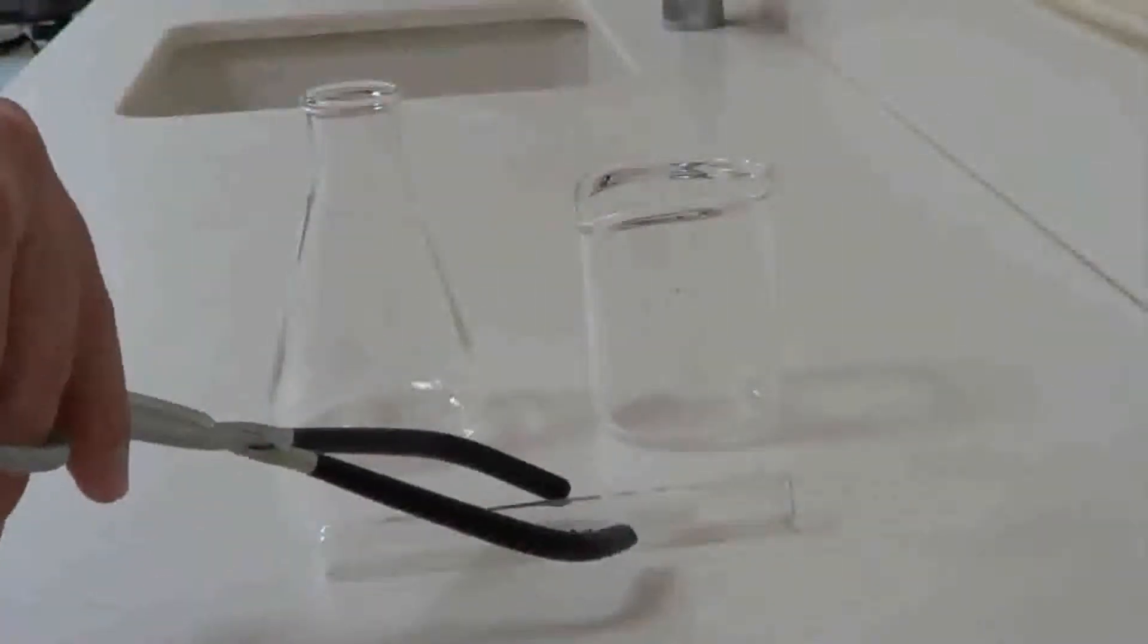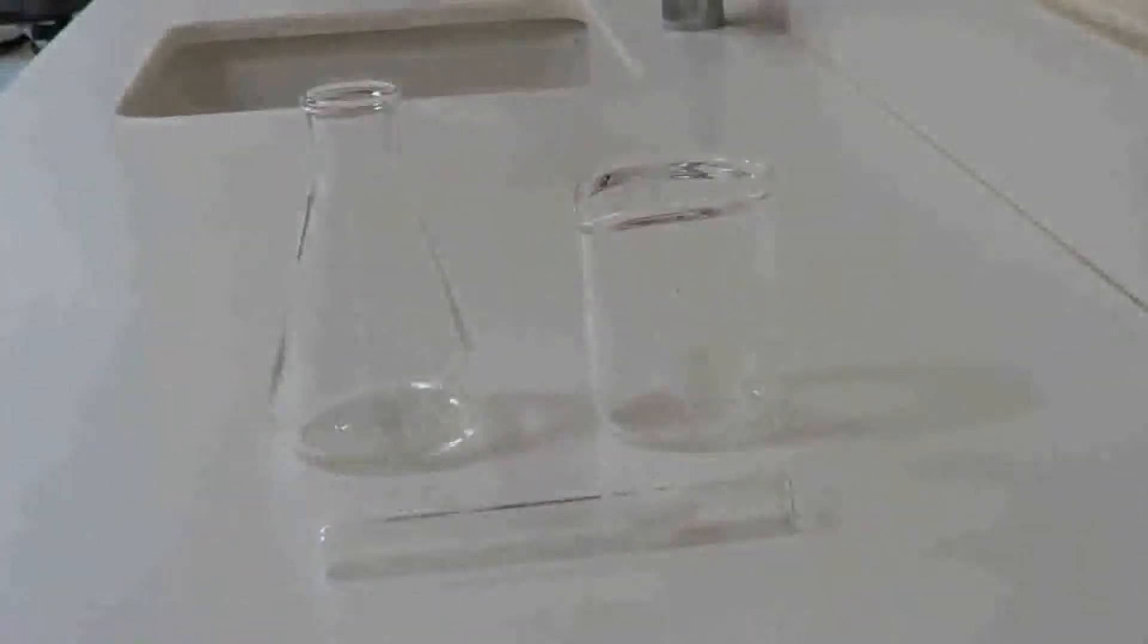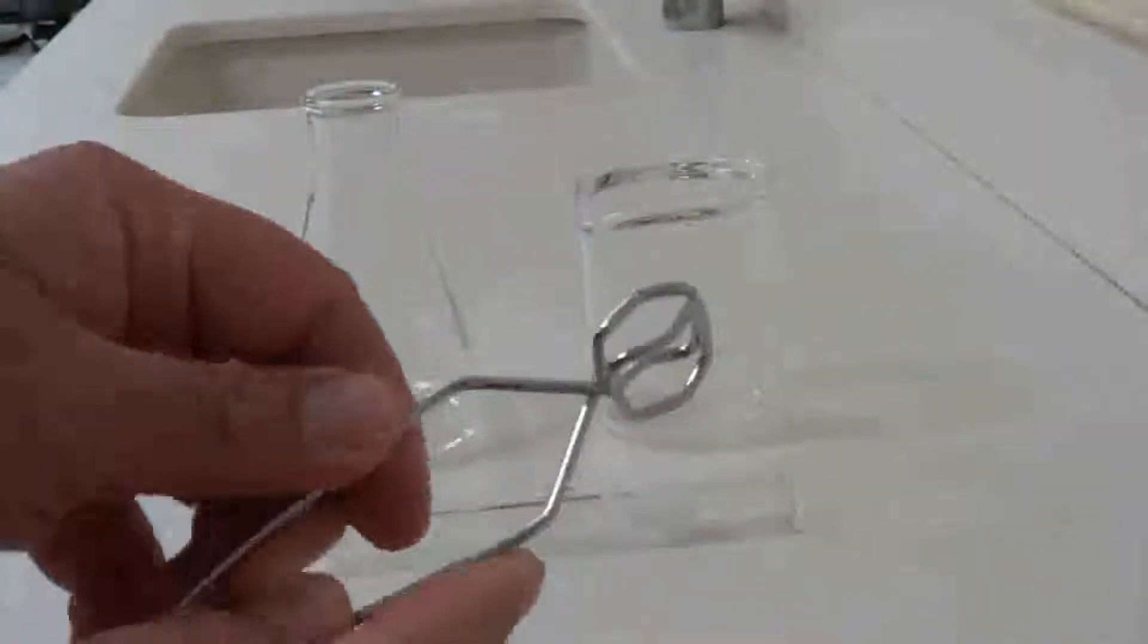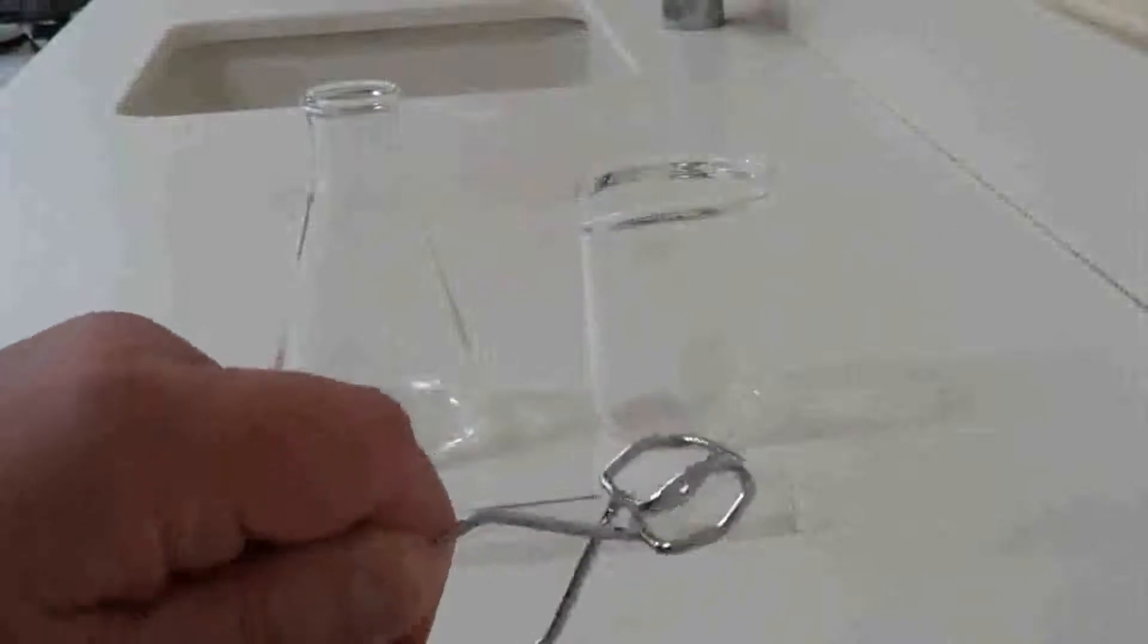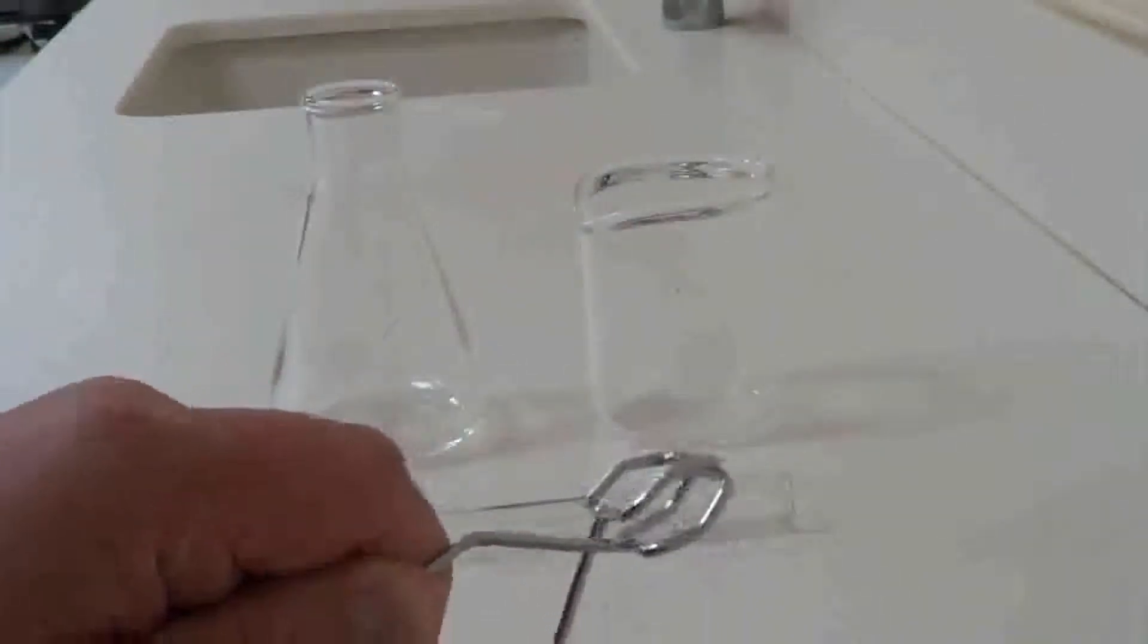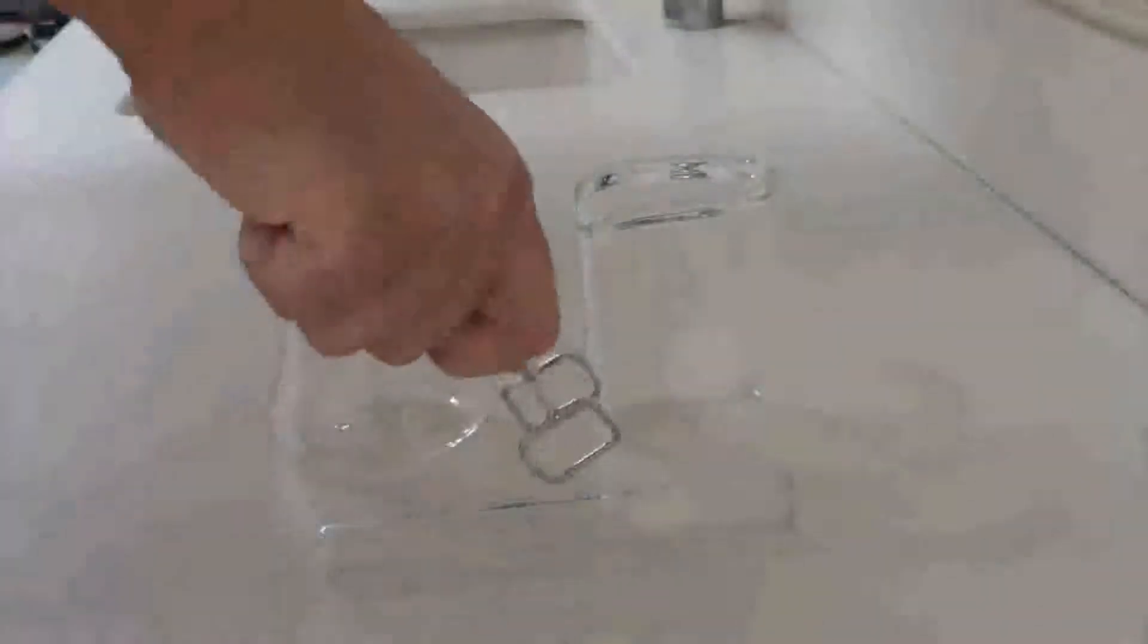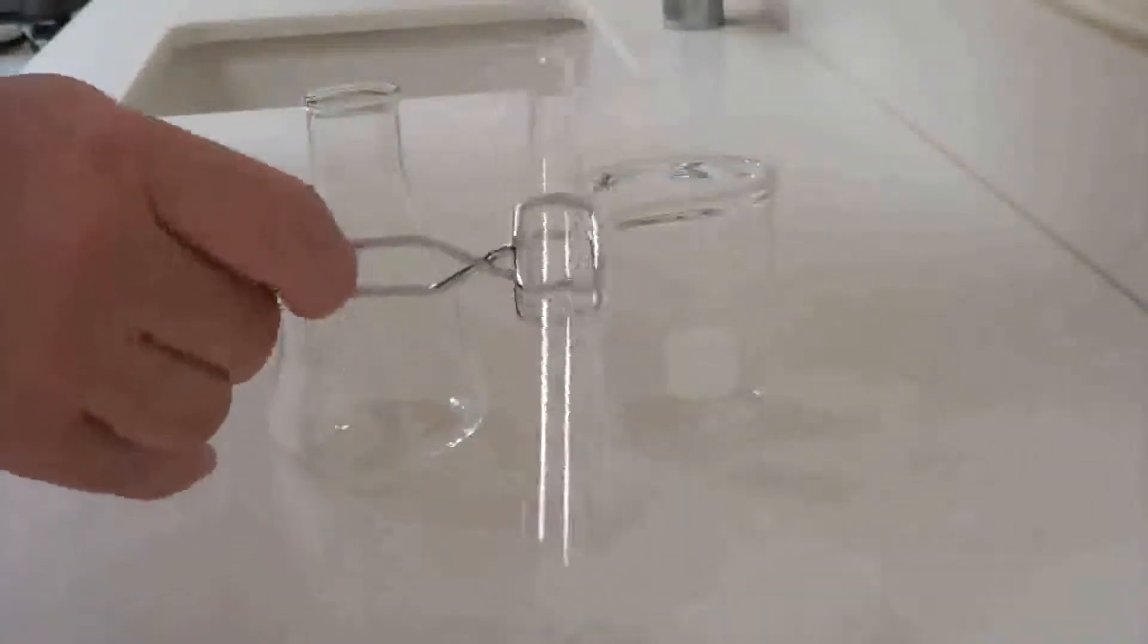You'll notice with a test tube, that's a trickier proposition. So instead of using tongs to grab a test tube, we use what's called a test tube clamp, which looks like that right there. The way this works is that you squeeze the sides of the clamp, and you'll have to squeeze pretty hard, and it opens, and you can just wrap that around the body of the test tube. It will clamp tight, and now you have the test tube gripped very nicely.